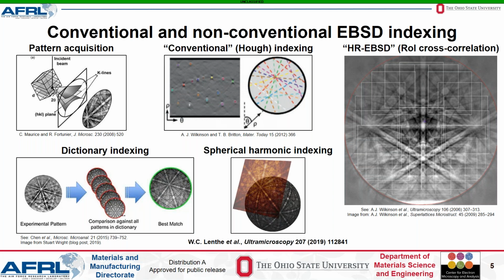This approach is fast, easy to automate, and reasonably tolerant of noisy patterns. However, it does not provide impressive orientation precision, typically on the order of 0.5 degrees, give or take a few tenths of a degree.